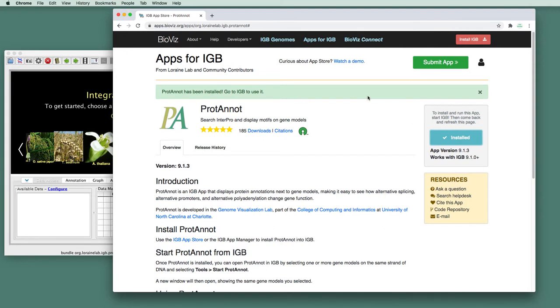And a little banner appears that lets us know that ProtoNote, this particular app, has been installed. And we can go to IGB to use it.